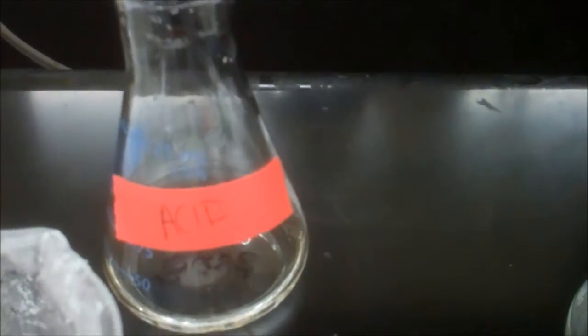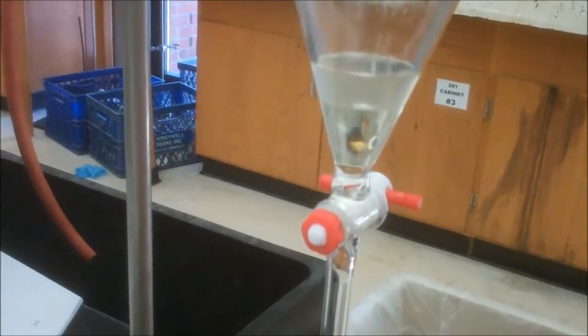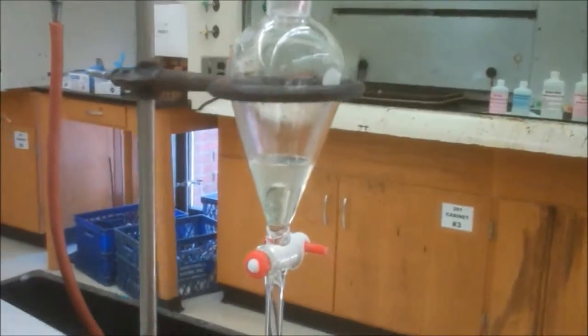That's the conjugate base of the acid. And then the organic layer had the amine in it. And then now we're separating the amine out of it. So now you're going to try to isolate the amine.